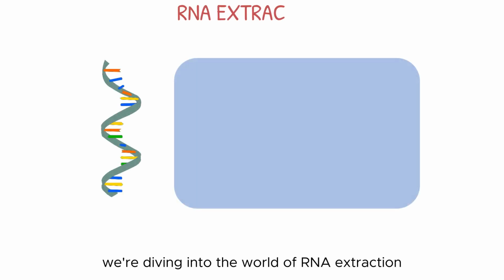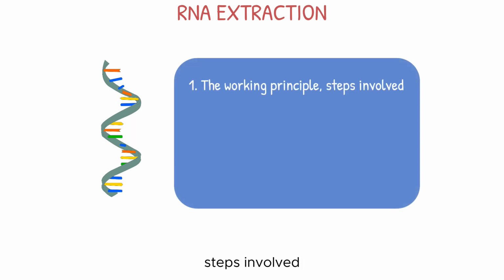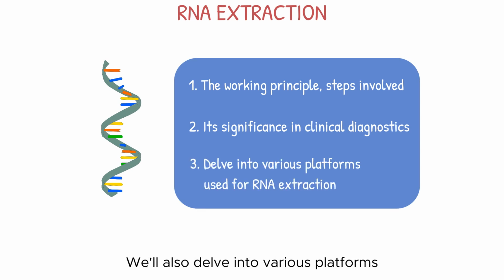Welcome, everyone. Today, we're diving into the world of RNA extraction. We'll discuss the working principle, steps involved, and its significance in clinical diagnostics. We'll also delve into various platforms used for RNA extraction.